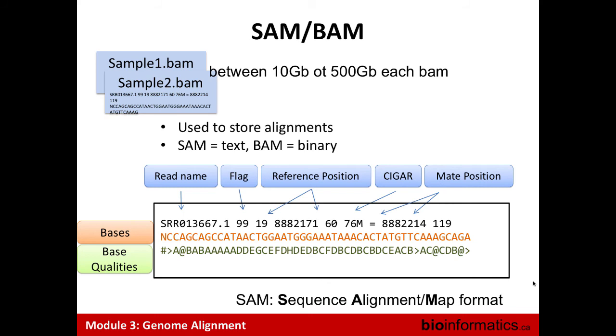How does it know it's the right location though, if it's not the same base? Sorry? How does it know it's the right location? It looks at all the other bases. It's kind of a seed, extension of the seeds, and so on. If you change that, or if you include an insertion or deletion, it will create too many mismatches, so it says, okay, no, I need to put this base here to have the continuity of the rest of the sequence. This is not the exact same base, but this is a substitution, and I'm tolerating this substitution.